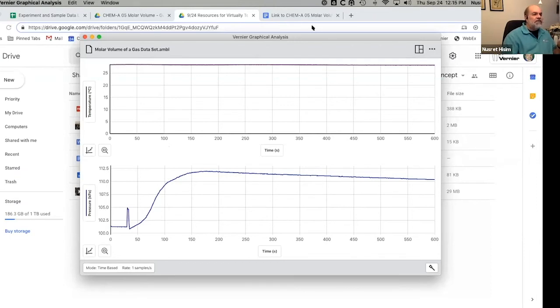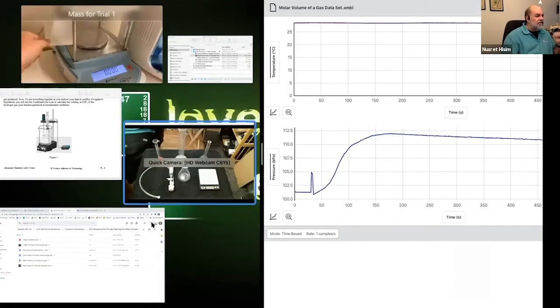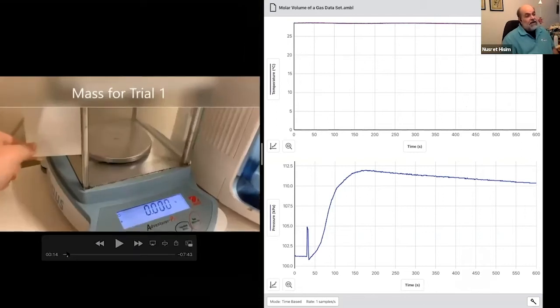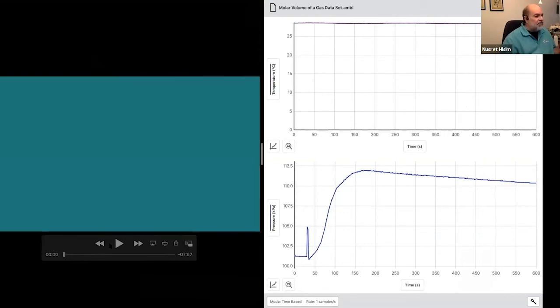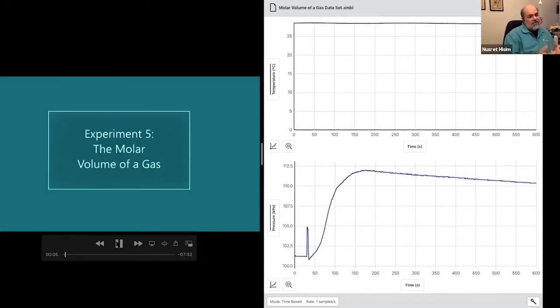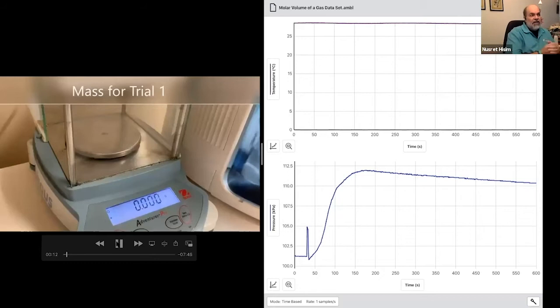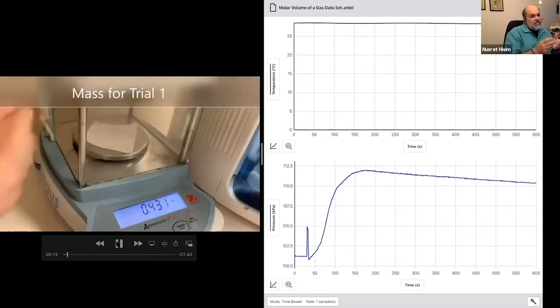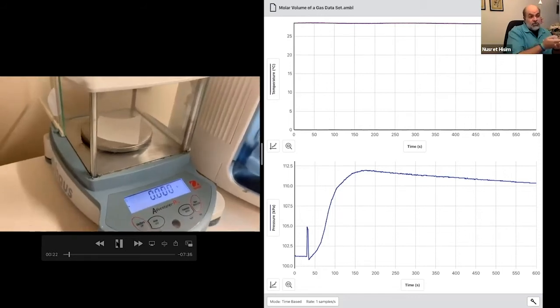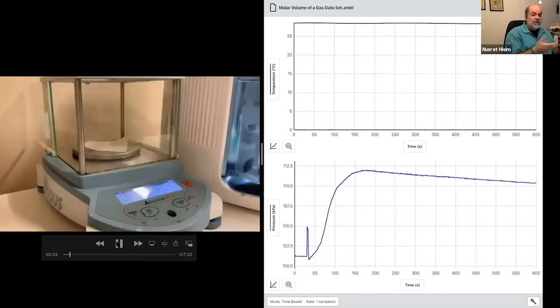I'm going to tile my screen so you can see Graphical Analysis on one side and the video on the other. Let's take a look from the beginning, as a student would. If you remember this experiment, you take a little piece of magnesium. Melissa determined that the mass of all the water in the flask was 151 g — we're going to need that later. You'd mass out a little piece of magnesium. Students will need that value because from it they can calculate the moles.